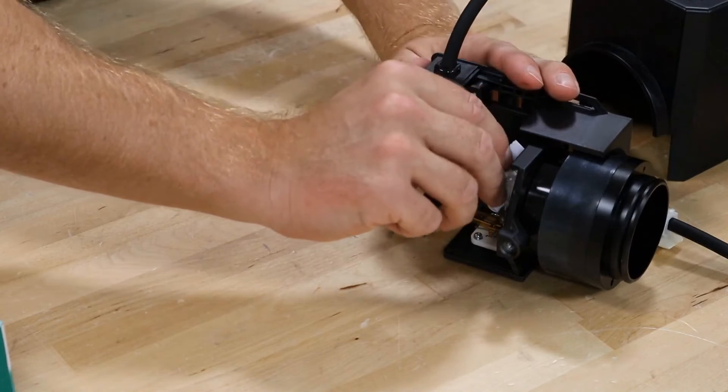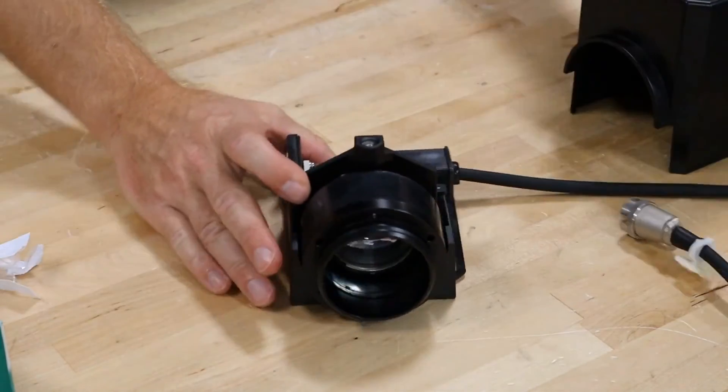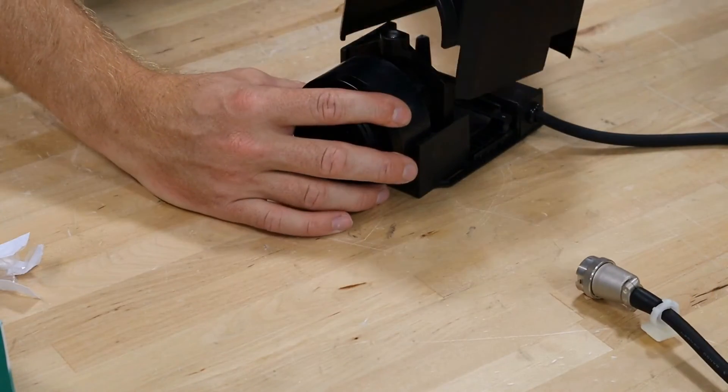After that, all you have to do is replace the cover, secure it with the screw, tighten everything up, and then reinstall your lamp house in the reverse order of the way you took it off.